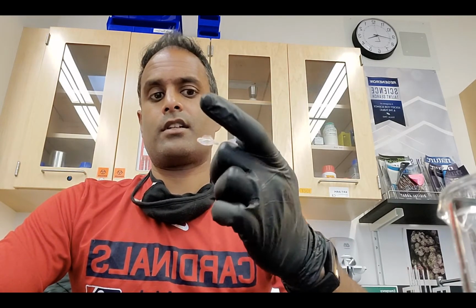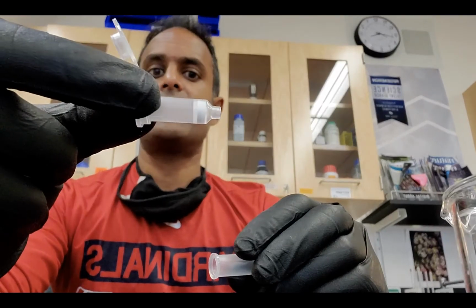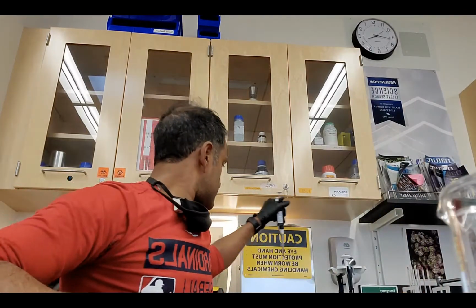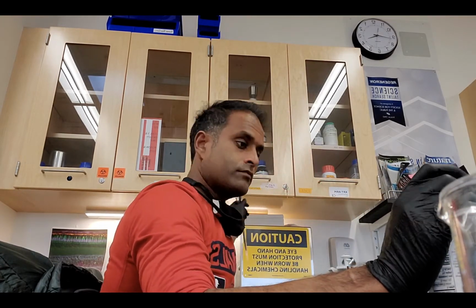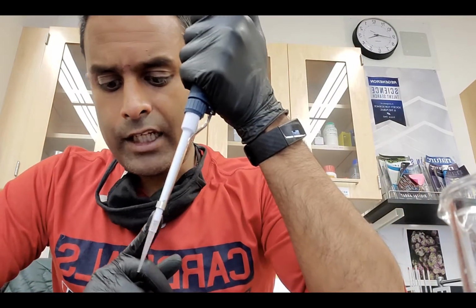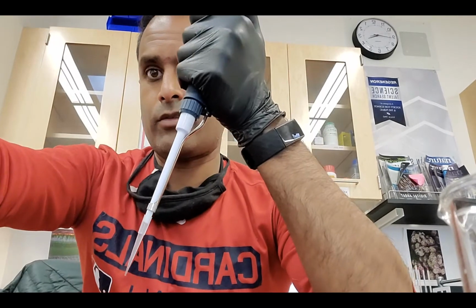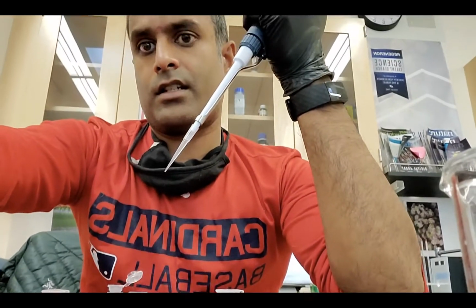So I've got my tube open, and you can see it's composed of two parts. It's got the column here, and then a collection tube. And what we're going to do is I'm going to take some of my solution, and then I am going to go directly over the center of the tube and pipette down into the column. So if I were to do it, I'm going to try to do it with you watching with one hand. Cool. All right, dump my tip.